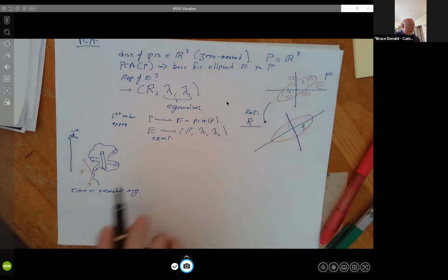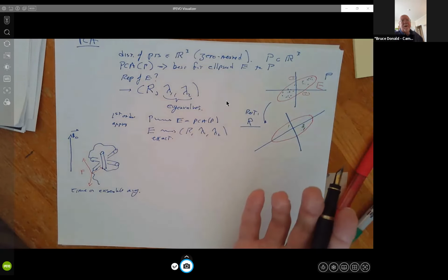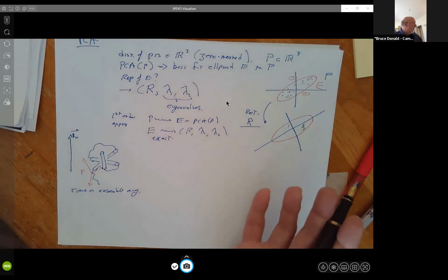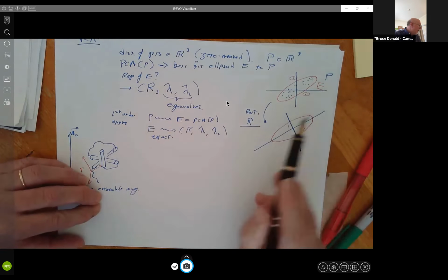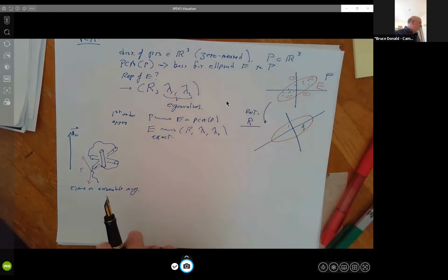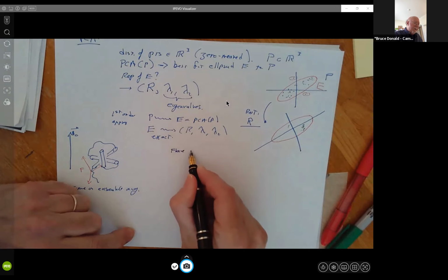So basically, if I'm in the molecular frame riding the bucking bronco, which is my protein here, I'm observing the tip of the flagpole, which is lying obviously on a sphere because it doesn't change in length. And there's a distribution of observed points of the flagpole tip. So I can treat this distribution of points, representing the orientations of the external magnetic field as viewed in the frame of the molecule, as a distribution like P. So I can then take an ellipsoid to represent those and represent that by a matrix. So that's the idea. So the basic conceptual steps here are: put a frame on the protein.